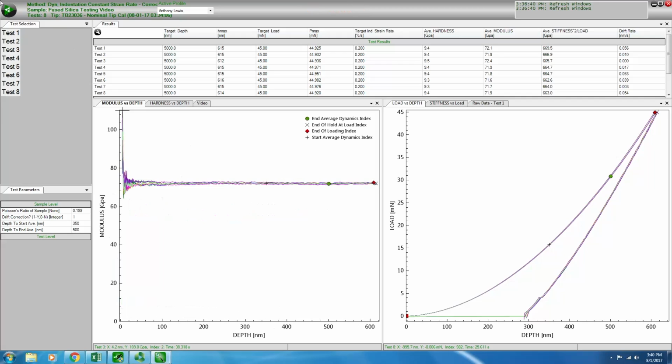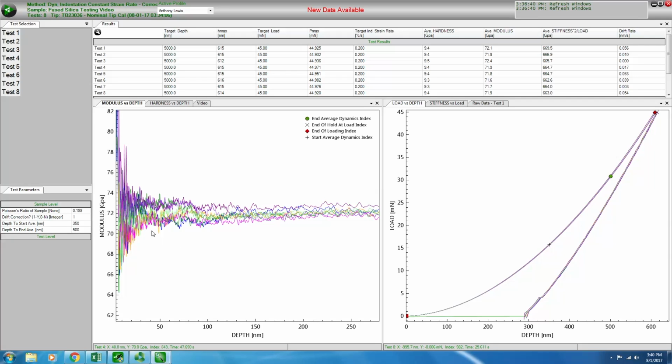Let's look at the revised data set now. On top of being within the range, the data set is now calibrated towards the lower penetration depths. I'm just going to zoom in there by creating a box. While it may not seem apparent, getting the tip calibrated at lower penetration depths is absolutely essential for the analysis of other samples that we have.